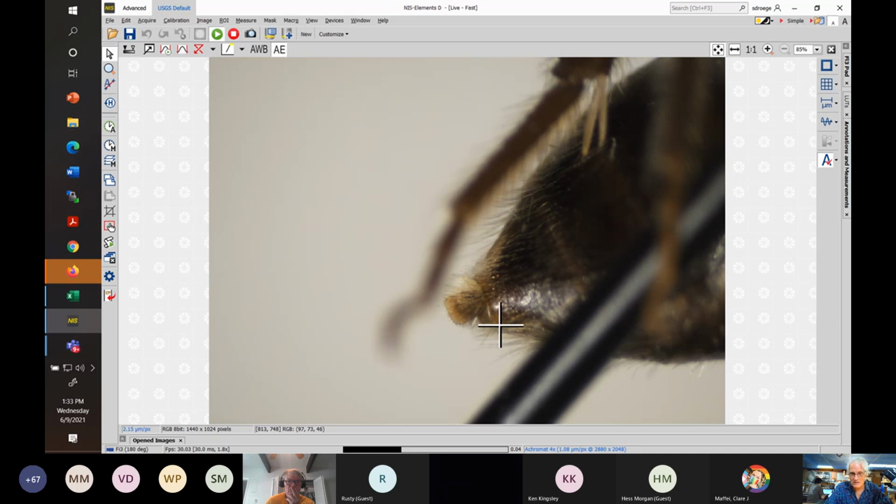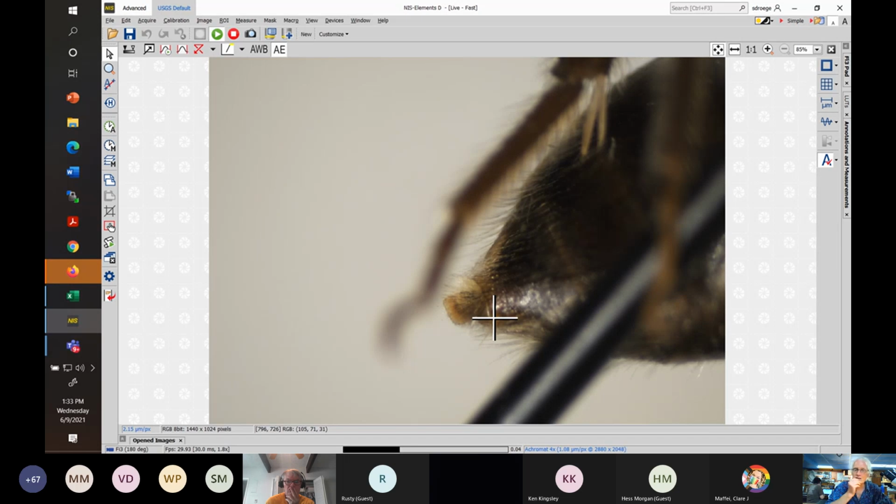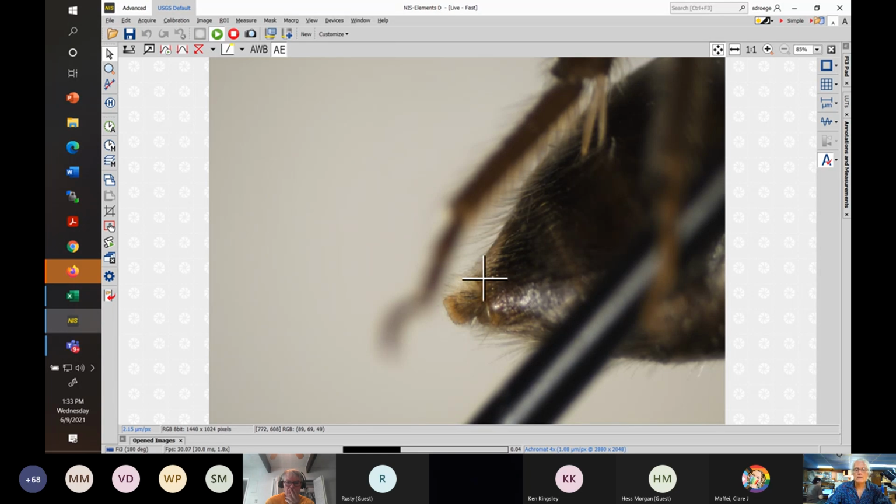But this last area, let's call it, and again, I'm using these things without knowing the terminology necessarily myself, this last area is important. There's things like whether this is bent back, its shape, whether there's extra hairs. When we're down at the species level in Andrena, which we will eventually get to, we're going to spend a lot of time looking at what's going on here. But this projecting S8, which may or may not, I guess we have to figure this out, be part of how to separate from Melitta, is a good character. If it's present, it's going to lead you to being confident or more confident that you have Andrena.